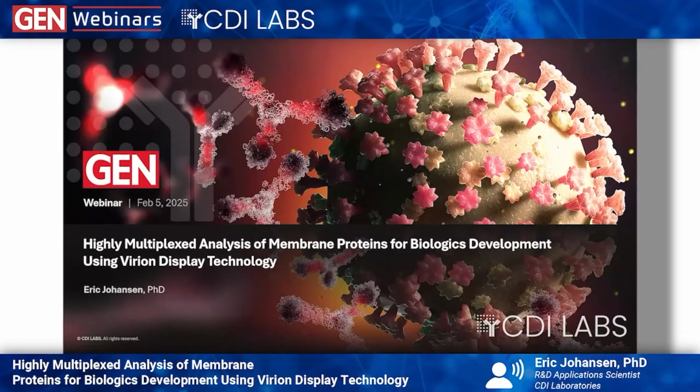Thank you for the introduction. I'm happy to be talking to the audience today more about the virion-displayed technology and how we can use it as a highly multiplexed analysis to look at different types of biologics.